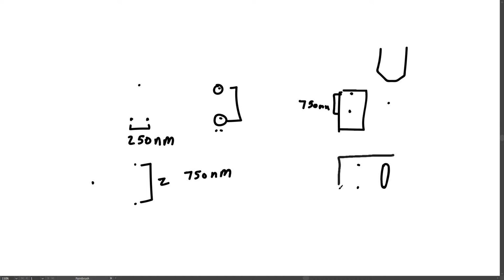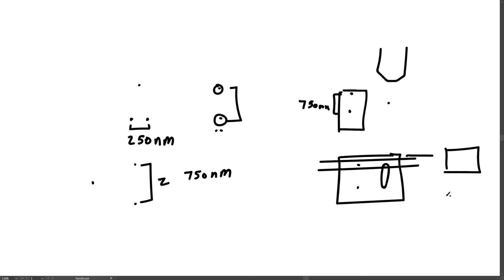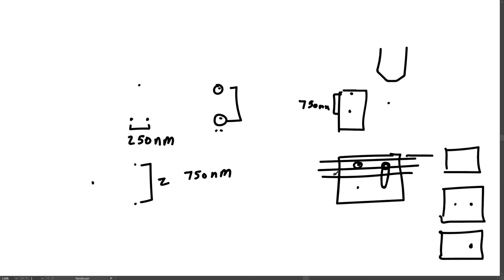And now if you embed this piece of tissue in resin, you can section this and then look at the section, and you wouldn't see anything because there's nothing in this section. But then if you sectioned here, what you would see in the camera is a dot and a dot. I mean, you'd see this is a dot, and you would see this is a dot. And then in the next section, you would only see the long object because there's nothing here.